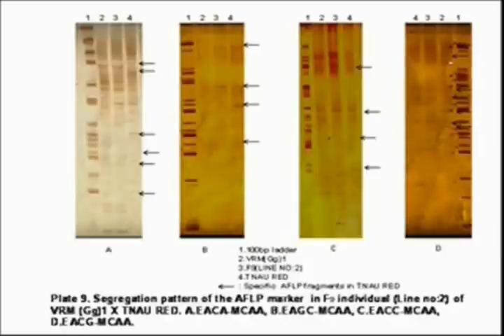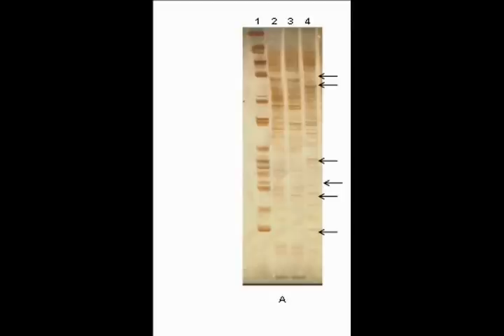This is the AFLP gel photo. Lane 1 represents the 100 base pair ladder. Lanes 2 and 4 are the parents, VRM and TNAU Red. Lane 3 represents the F9 population. Using AFLP, we are determining which parent the F9 population resembles. The arrow mark represents a band present in TNAU Red (lane 4) but absent in the F9 population (lane 3). The F9 population resembles VRM (lane 2) since the bands match each other.